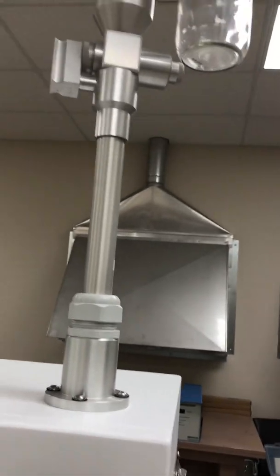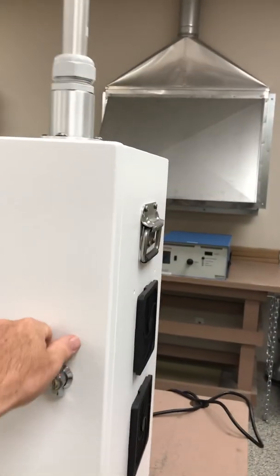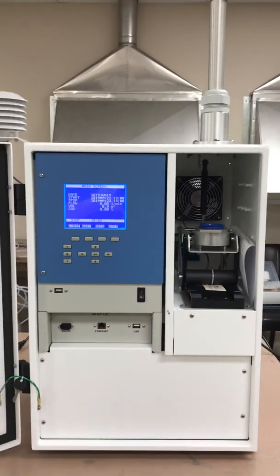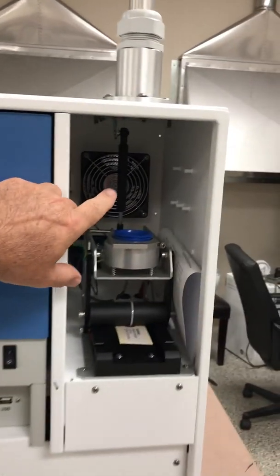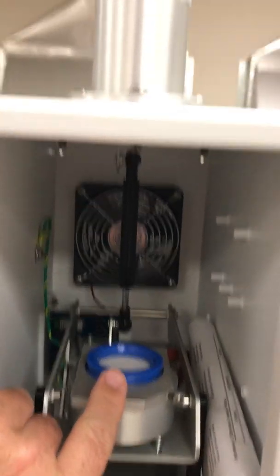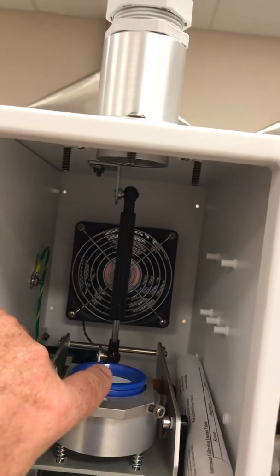Air comes down into the top of the unit through this mast assembly. We've got the front door, and what we do is open up this door. We have the electronic housing and the filter sample on the right. There's a multi-menu display here. On the right side is where the filter is collected — the particulate is collected on the filter. There's a tube that mounts and comes down from the top here.